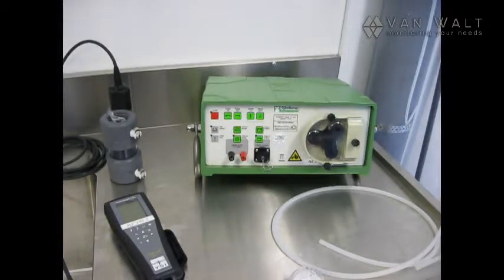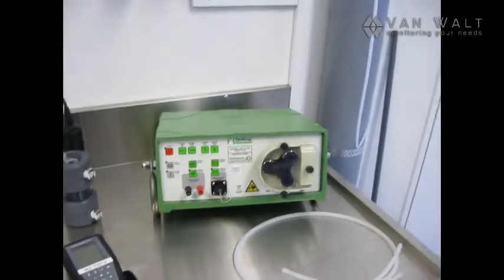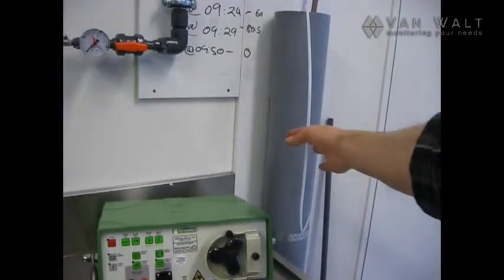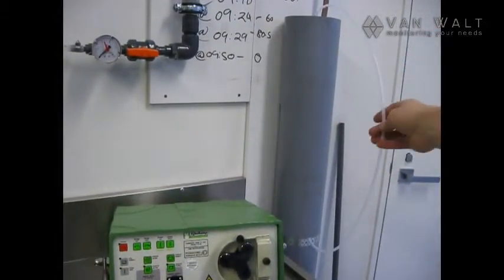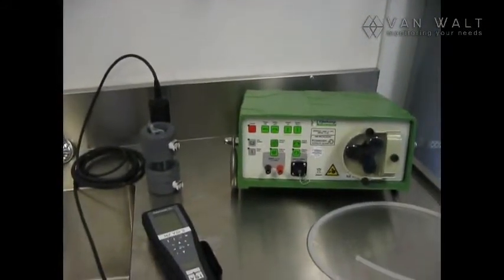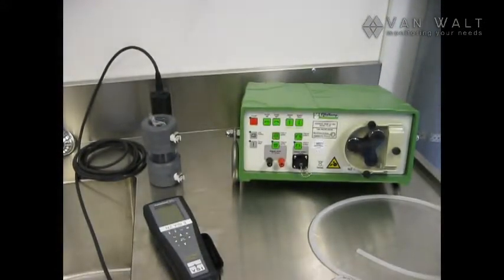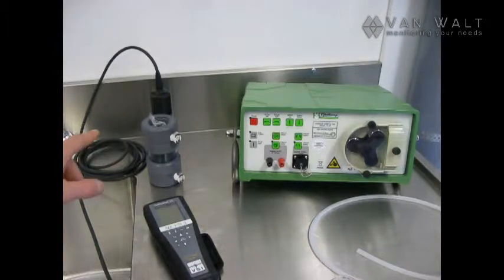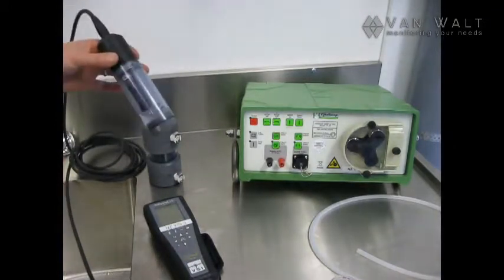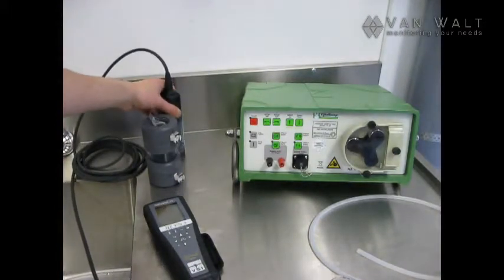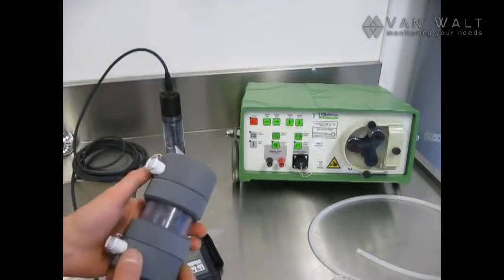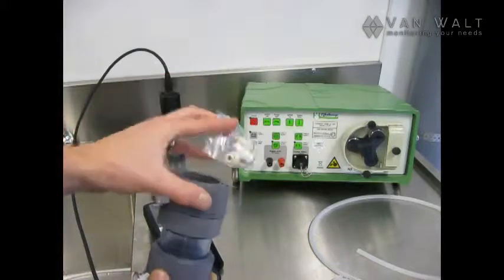Okay, so let's get set up for a sampling session. I have my test tank in the corner here and I already have some sample tube installed and the next thing we're going to do before we continue our setup is to turn on the YSI unit and I'm doing that now because the dissolved oxygen probe requires time to warm up and we will set up the flow cell and inside the flow cell you'll find some connectors.